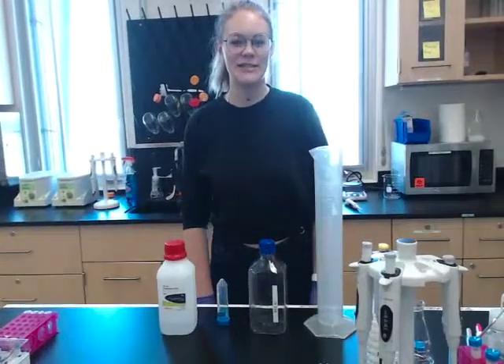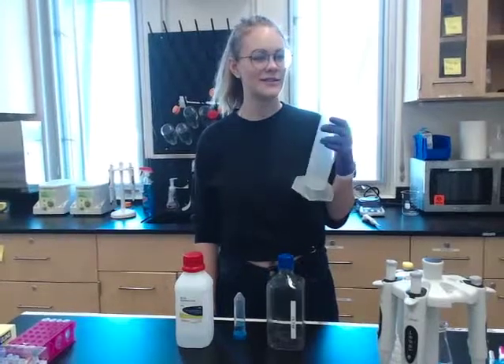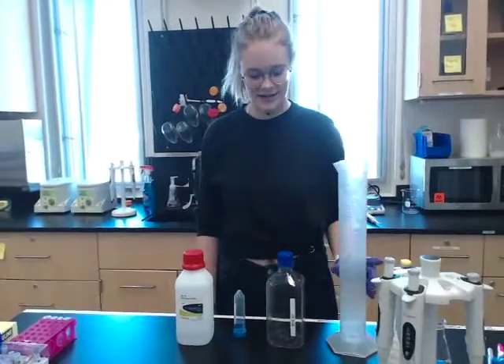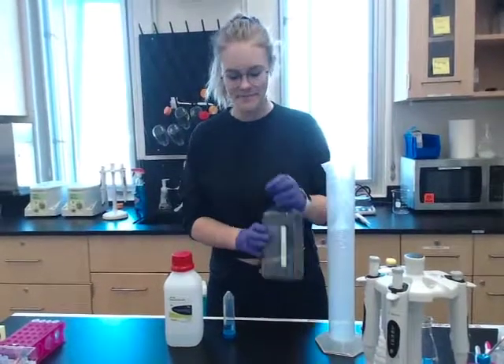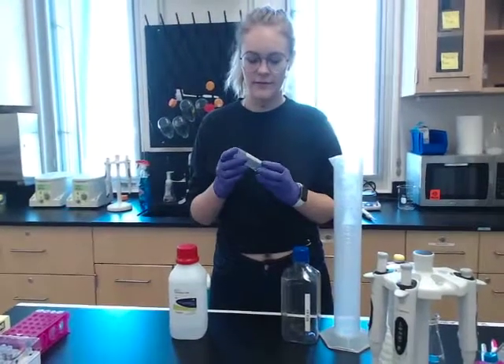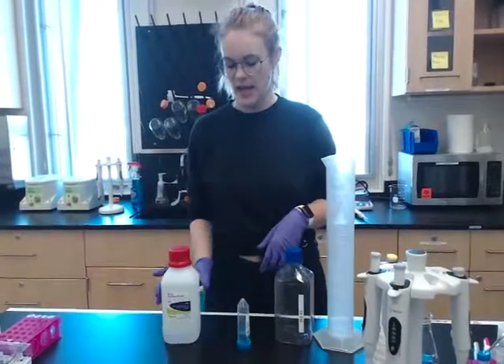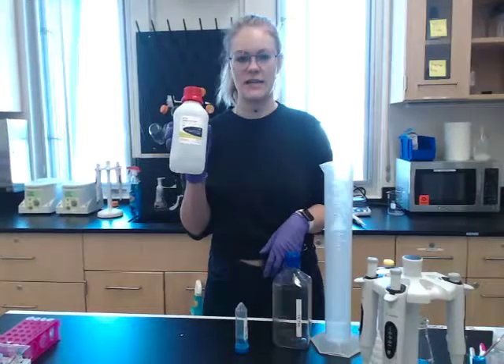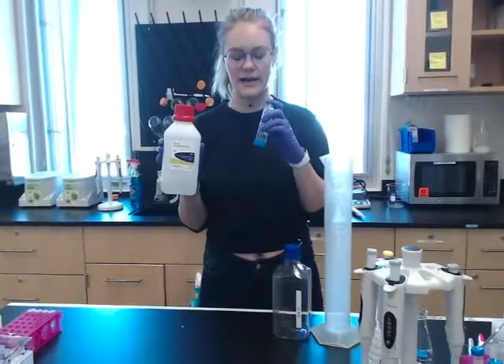Hi everyone, today I'm going to be teaching you how to make 1X TAE buffer. So you're going to have this 1,000 ml graduated cylinder, a 1,000 ml container labeled 1X TAE, an aliquot of 20 ml of 50X TAE, and eventually you will need this 50X TAE buffer to refill this after you've used it.